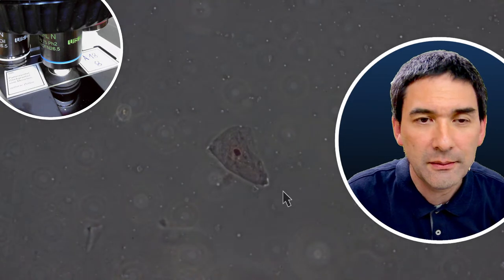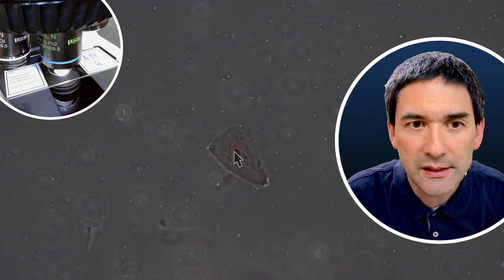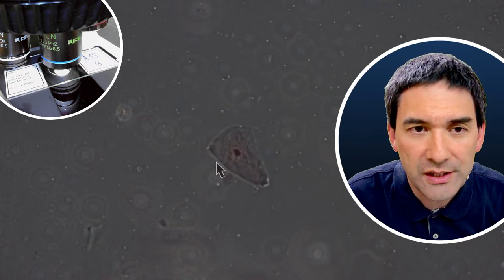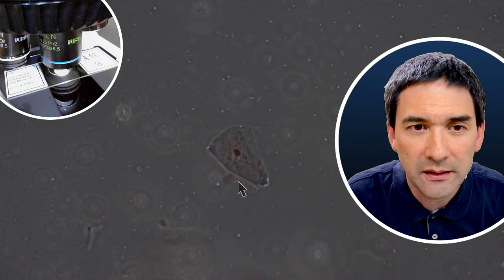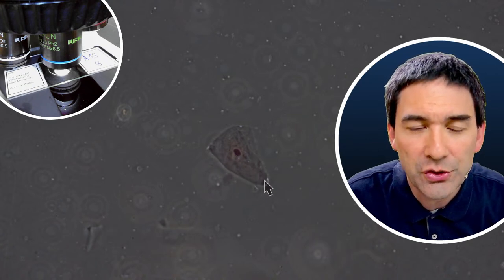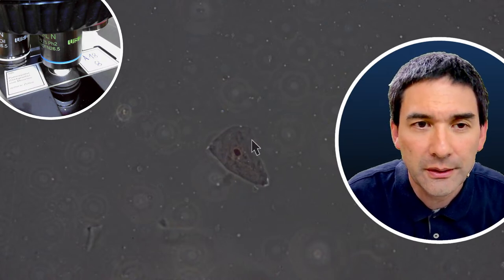Notice that the contrast is now significantly better. The nucleus can also be seen much better over here. Okay, and you can also see that the cell itself has this darker edge, and then it is a little bit brighter on the outside. That's also a typical phase contrast phenomenon. Yeah?